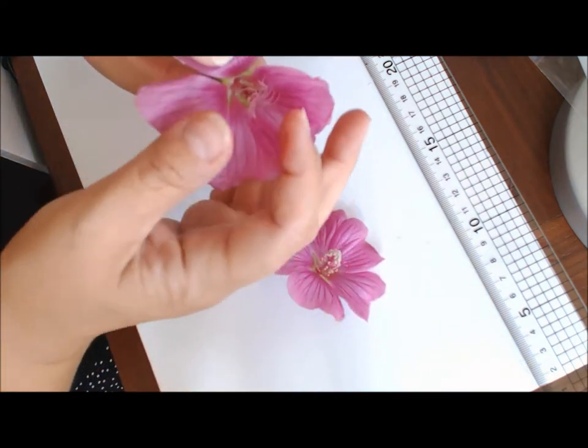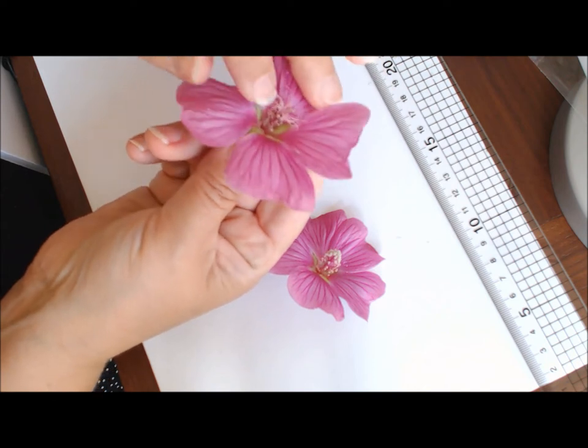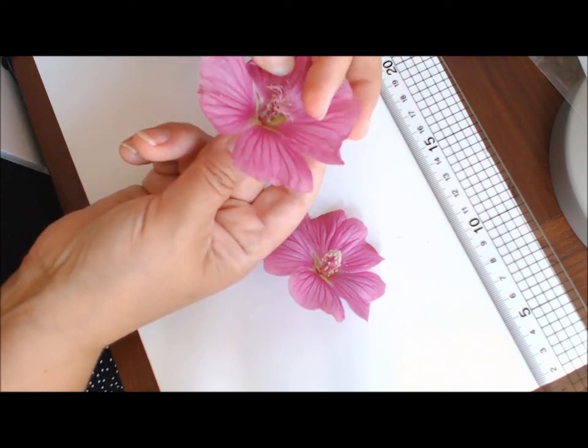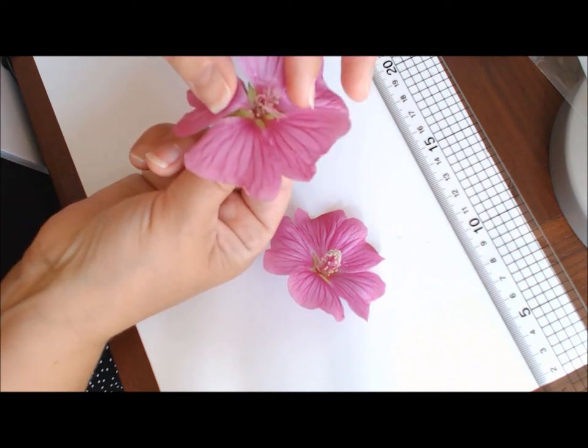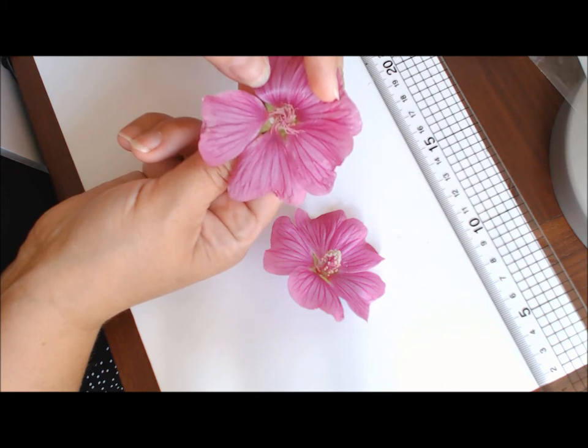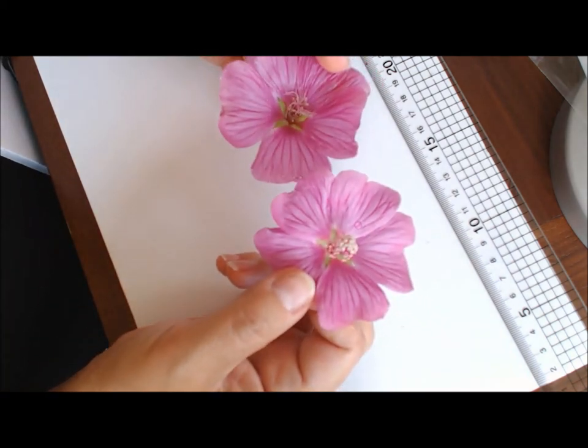On this one, which is an older flower, you can see the stigma here has emerged from that column. This flower has two phases. It has a male phase which comes first and a female phase which comes later.